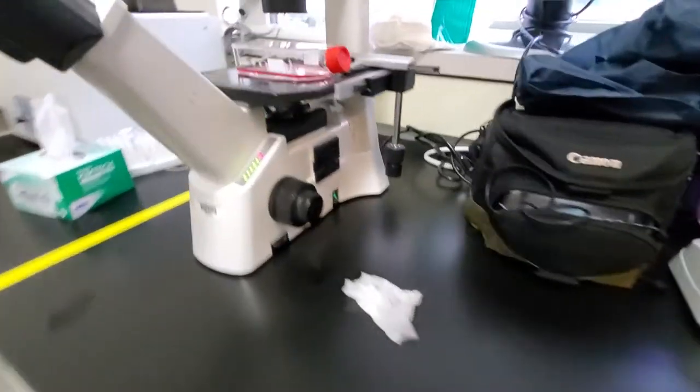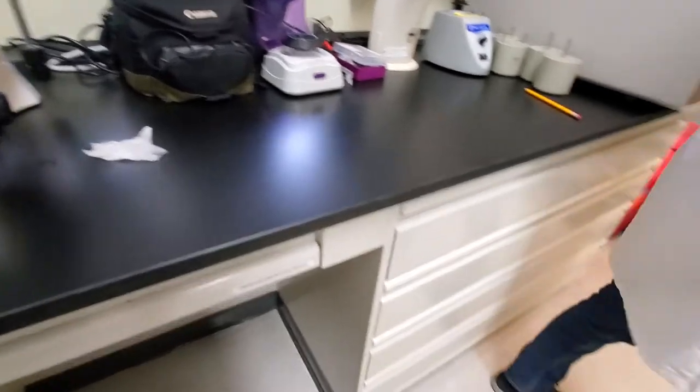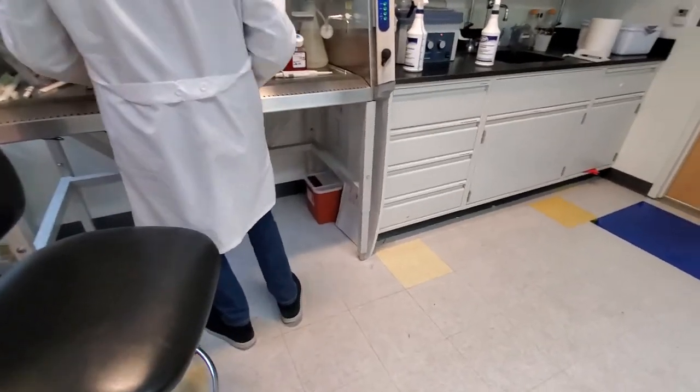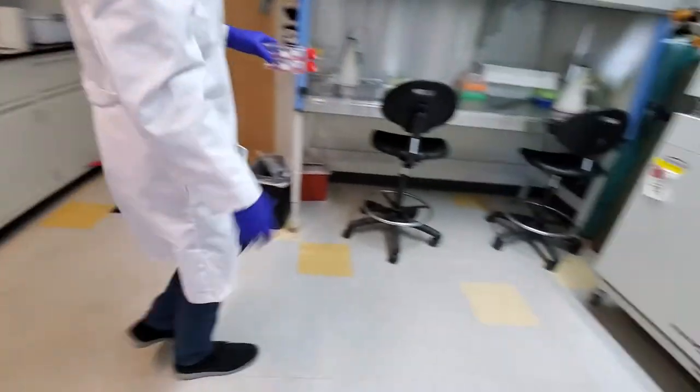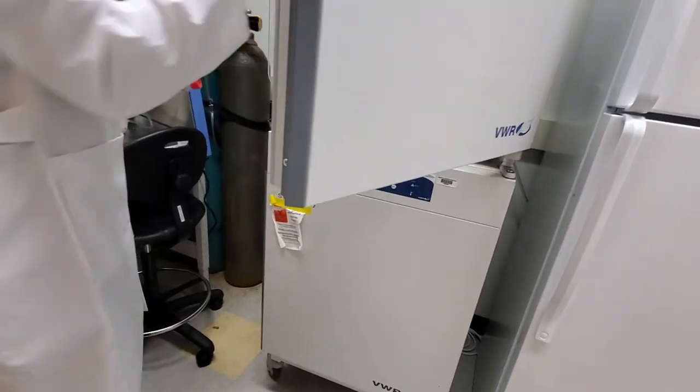Take a look. Yeah, little circles right now. You can see them? You can adjust the focus. And they look alive, from what I can tell. You could take a sample and do the trypan blue dye.